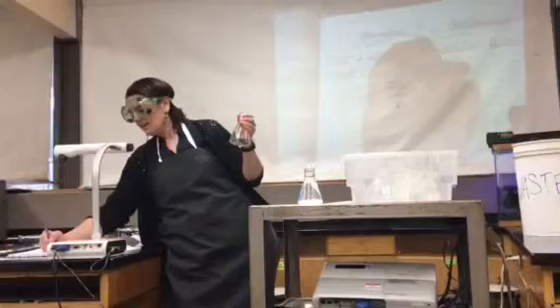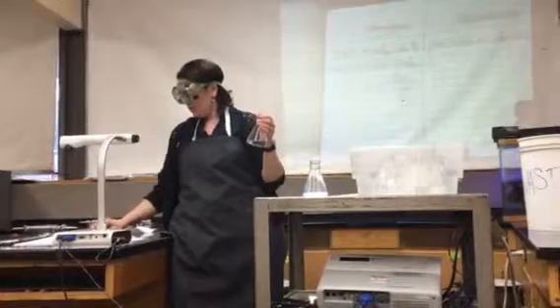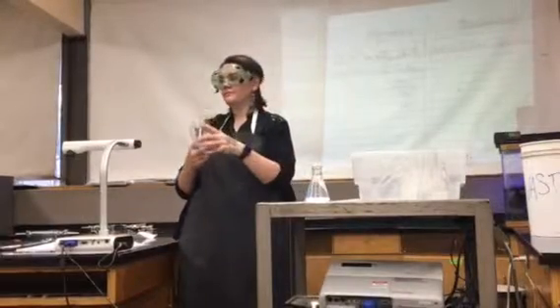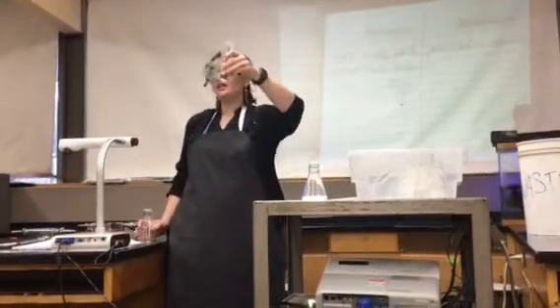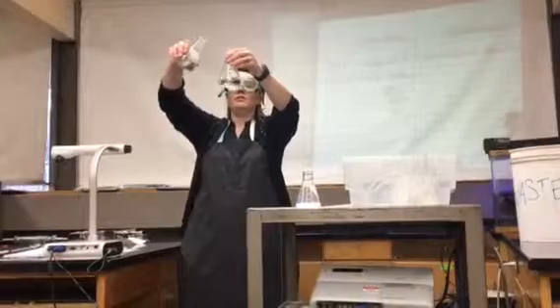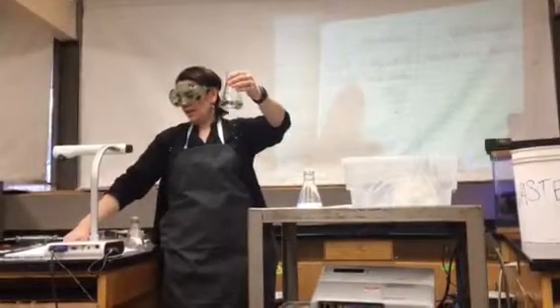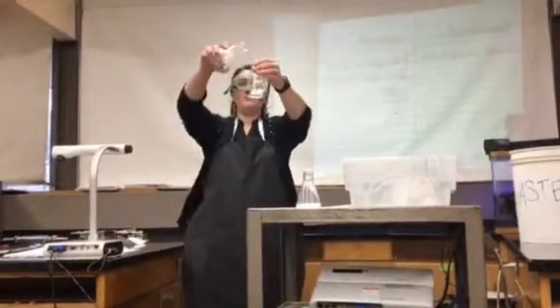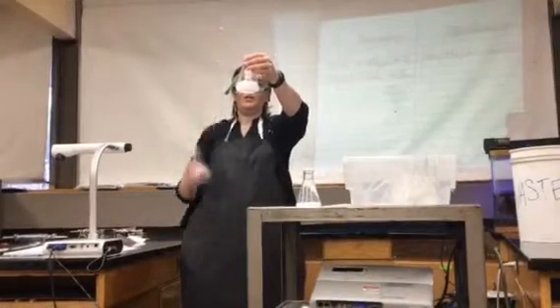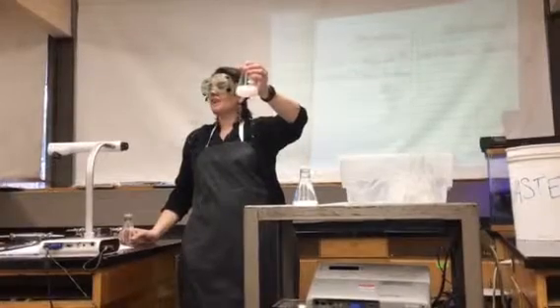All right. Who has an idea about what I should mix in next? Somebody wants to see C in here? What did C do last time? Turn pink. What do we think it'll do this time? Nothing. Turns brown. So A is already in here, so you think it's going to do nothing? Okay, let's check it out. I'm actually going to dump a lot of this in there, maybe the whole thing, and I'm going to do it slow. So right now I have D and E and A, and I'm going to add C. You ready? So A made it go away, and C made it come back.